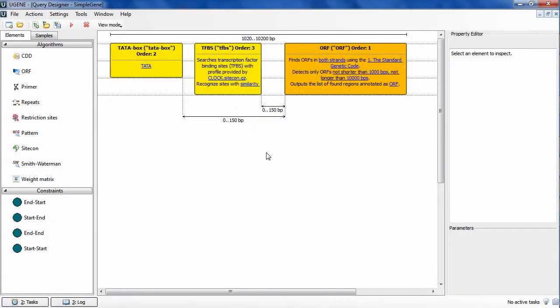Hello and welcome to the new UniProEugene Podcast episode. Today's topic is Eugene Query Designer and its basic functions. This is the Query Designer plugin, one of the new unique features of Eugene 1.9.